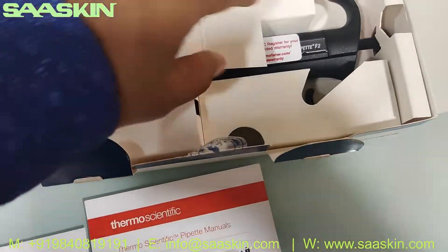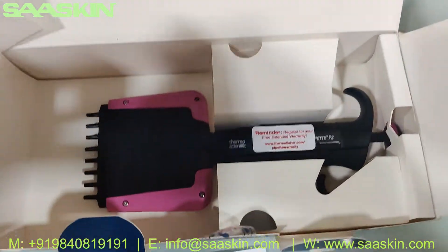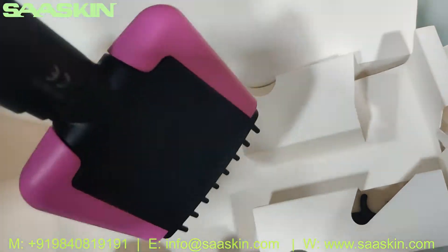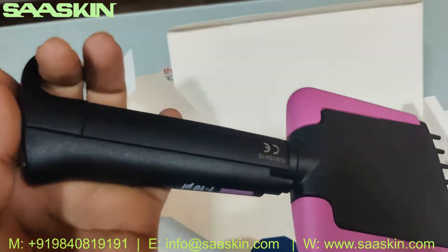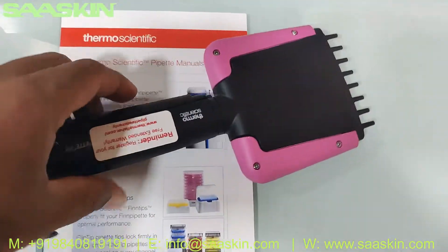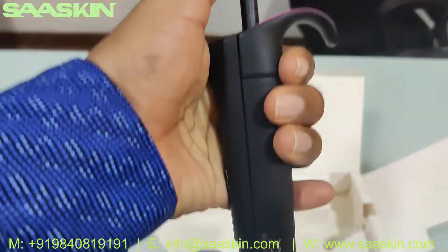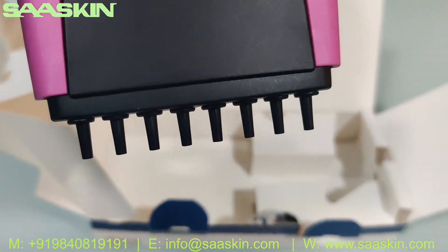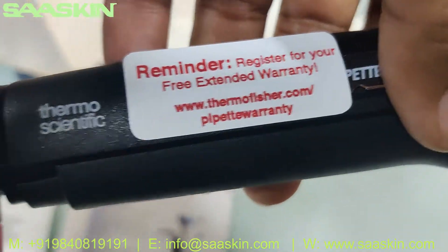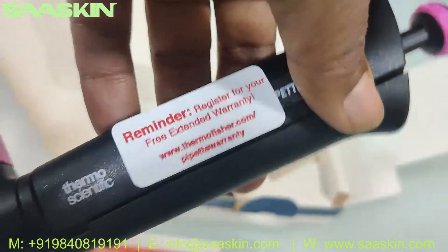Here is the pipette — it is the multi-channel 8-channel model. This is how you operate the 8-channel pipette. You can see the sealed body, and you can read the range of liquid that you pull out. Just a reminder again to make sure you register this kit.